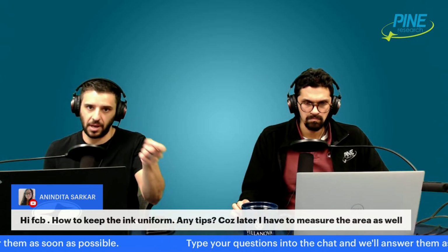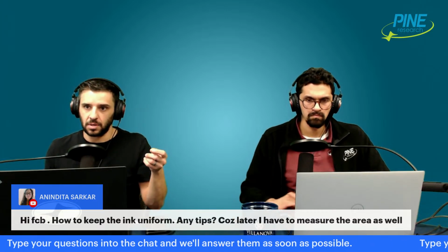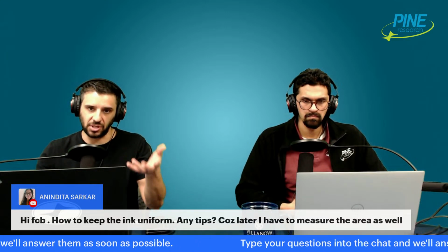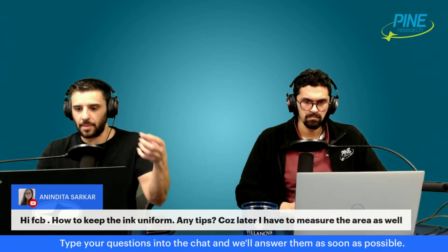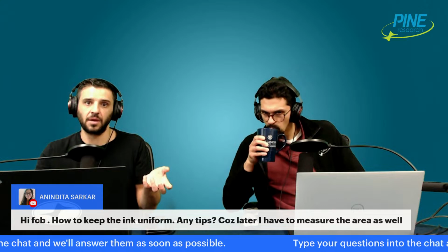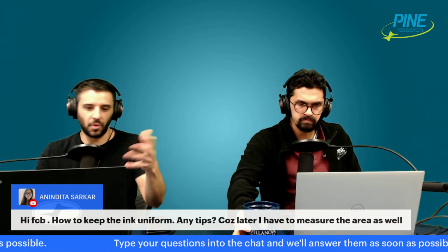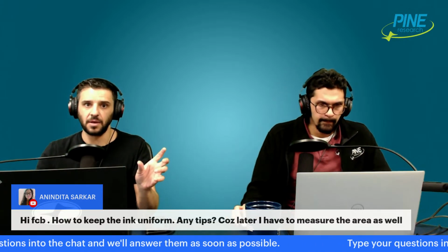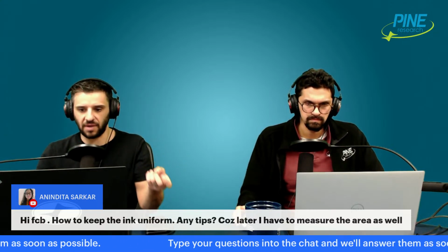Now you know how many milligrams you've added, and you can assume the solvent's all gone. So actually the mass that you've added is just whatever solids were in your ink, which is the platinum on carbon or whatever it is, right? So you know how many milligrams you have of that. You can do it again because you're trying to get some loading. You're trying to get like 25 milligrams per square centimeter, whatever, right? So just calculate what's the surface area, how many milligrams difference did I add? Paint it again, dry it, mass it until you get roughly the loading that you want.